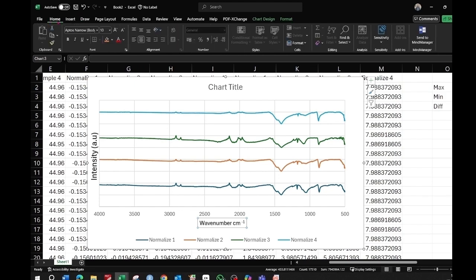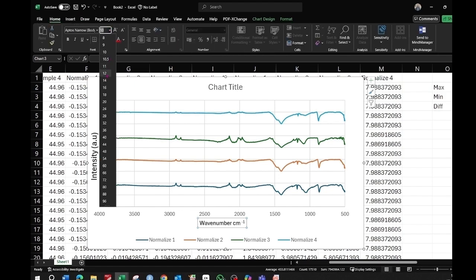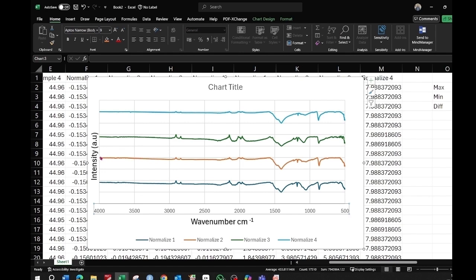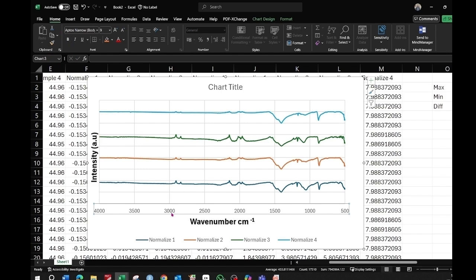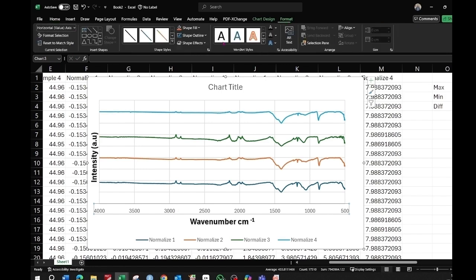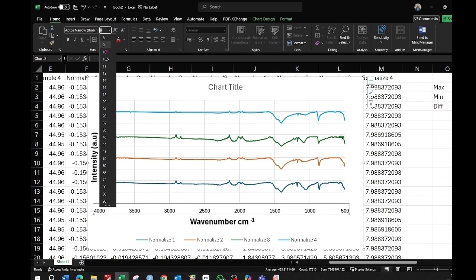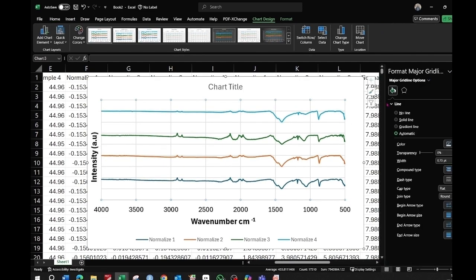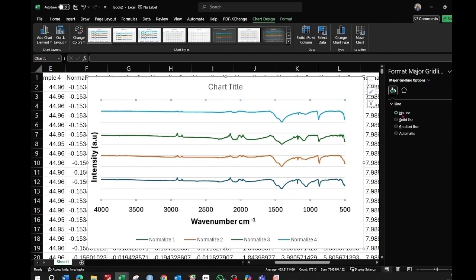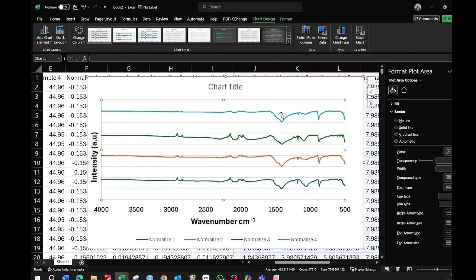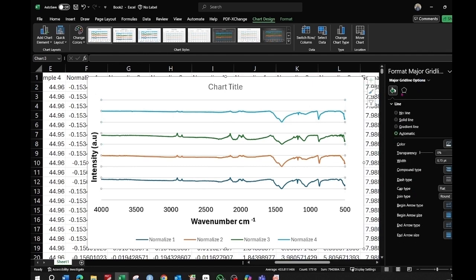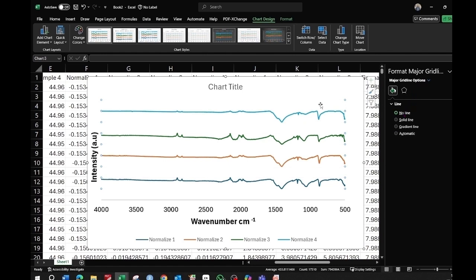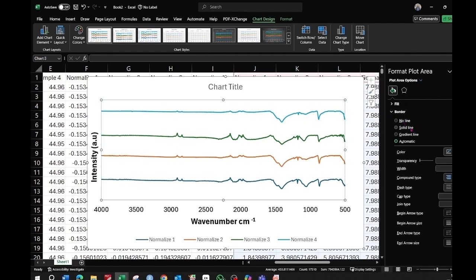Do the same for the y-axis title: go to Format, make it bold and black, and set the size to 14. Similarly, select the x-axis values and apply the same font style and color. Then select the gridlines, double-click to open Format Gridlines, and choose 'No line' to remove them. Do the same for the other gridlines.